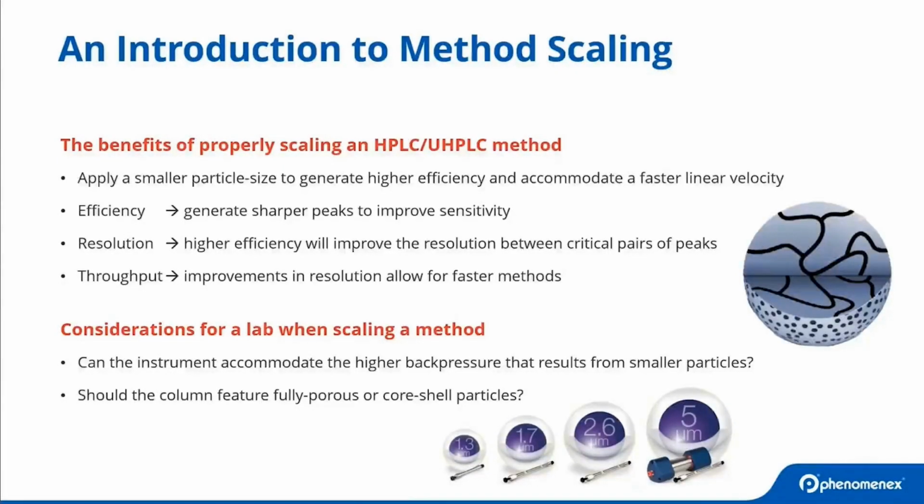Once you have improved your peak efficiency and resolution to a certain point, it's not necessary to have such a long separation runtime. So you can then take measures to shorten the runtime of your method while preserving your desired resolution.